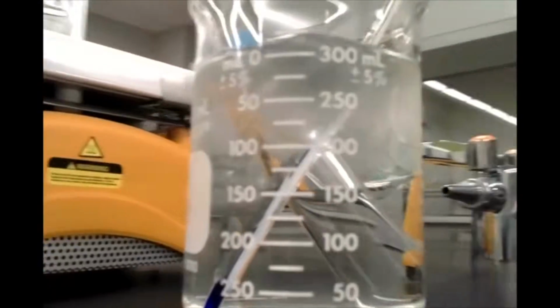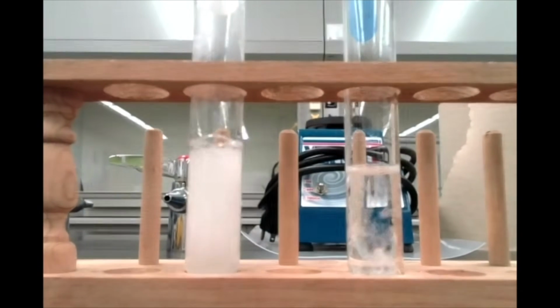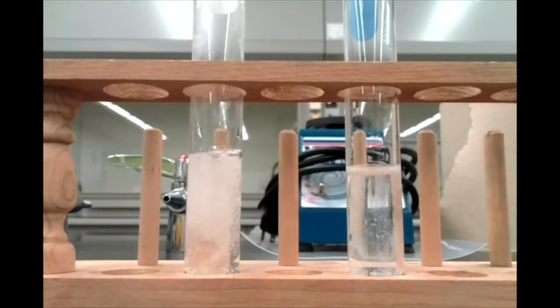Okay, so let's go ahead and put those in a test tube holder. Okay, so I have my two test tubes here. The one on the left is the hot one, that's about 53 degrees Celsius, and the one on the right is the one that dropped down to about 6 degrees in the ice bath. So let's go ahead and add a spatula tip full to each of them quickly. You should be able to see a clear difference in their levels of reactivity.